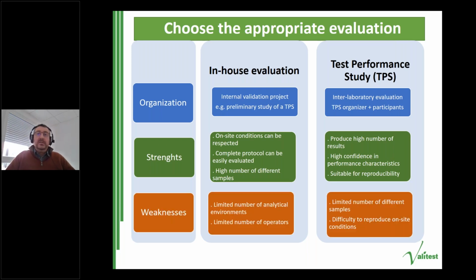As main weaknesses, in-house evaluation has a limited number of analytical environments and of course a limited number of operators, whereas test performance study has a limited number of different samples and it can be difficult to reproduce on-site conditions. If we look at the specificity of the on-site test, we can see that in-house evaluation is a little bit more appropriate because on-site conditions can be respected, whereas it's more difficult to reproduce on-site conditions in the case of the test performance study.